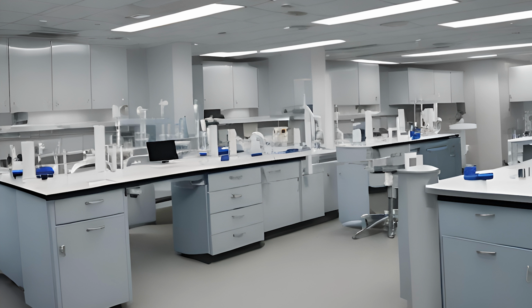You're also going to have spill kits for acids, caustic materials, or flammable solvents. Such kits are commonly made out of things like dry kitty litter and a broom and a dustpan. You want to know where they're at, because if you spill something that is dangerous, you need to be able to respond immediately.